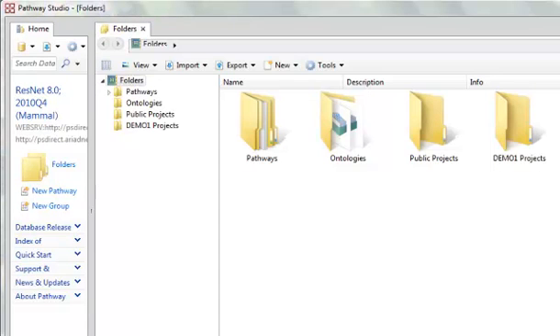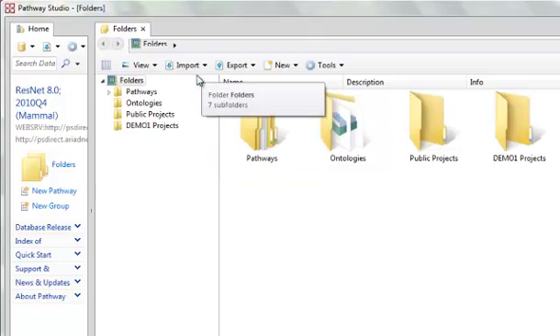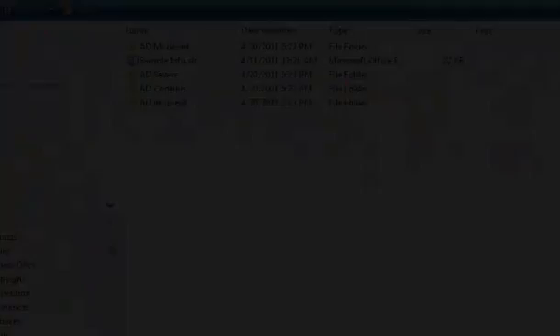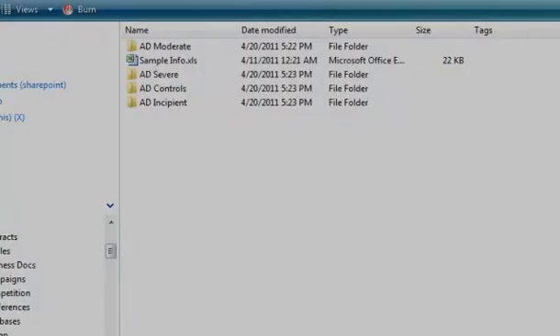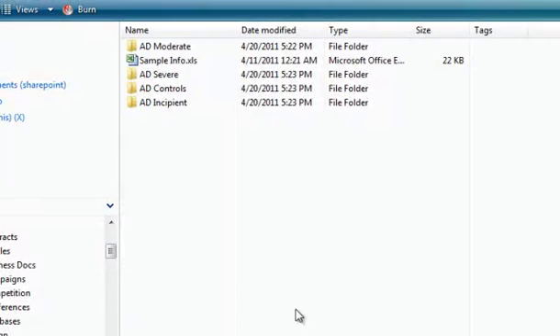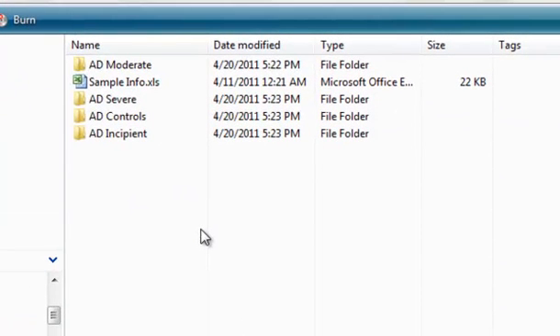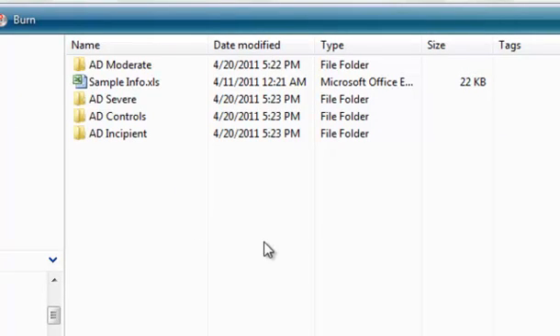Hello. So now we're going to run through how to import experimental data into Pathway Studio. Here I've downloaded some gene expression data from the GEO site. This particular experiment is GSE1297, an Alzheimer's disease study.